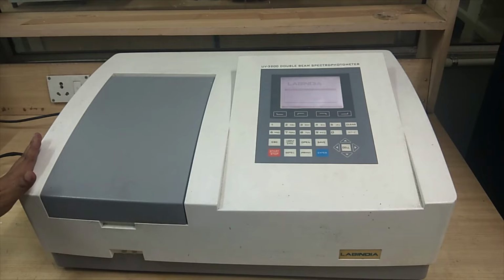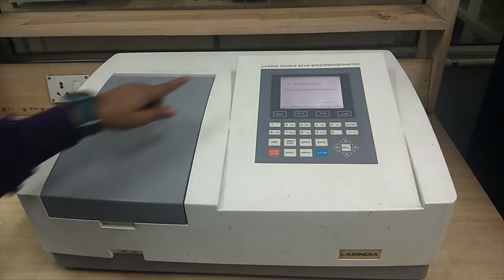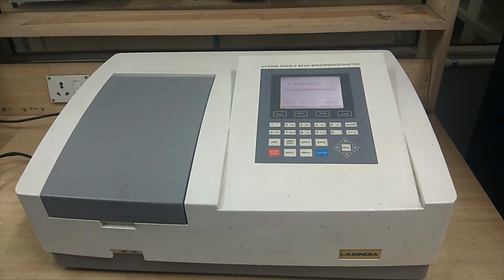So as we have already discussed the principle of spectrophotometer in the tutorial video, what is different here is the terminology double beam spectrophotometer. So here what happens is the single light beam in the double beam photometer basically gets split into two beams for the diffraction process, and here the monochromator, which was shown in the tutorial video, plays its role by selecting the specific wavelength of light for the spectrometry process.